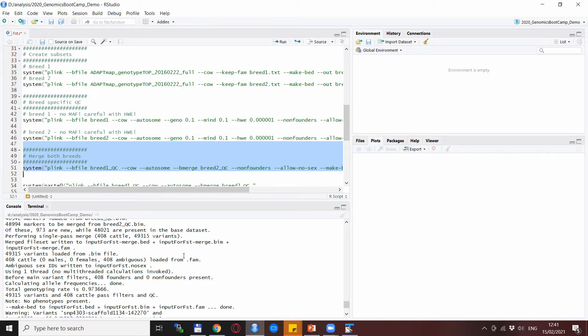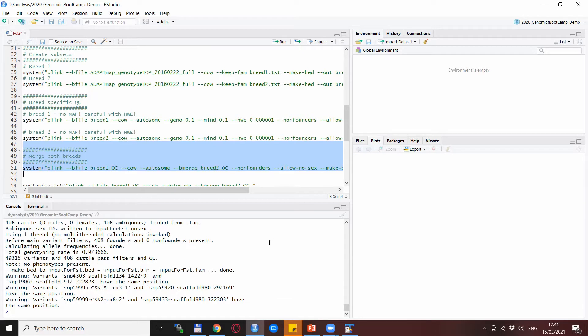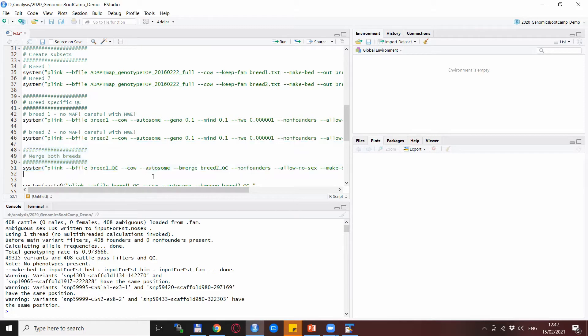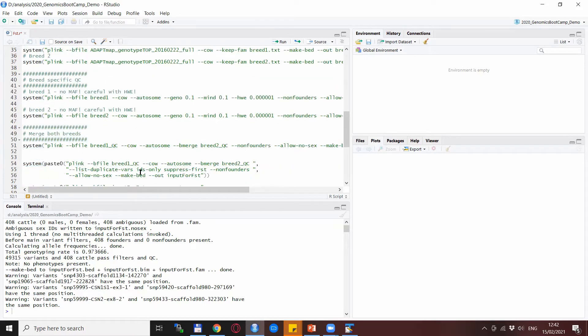Now in this case there is a strange thing happening—apparently in the two map files there are SNPs that are called differently but apparently they have the same chromosome and position. I don't think this is a huge deal, but just to be on the safe side we can deal with this in the follow-up lines.